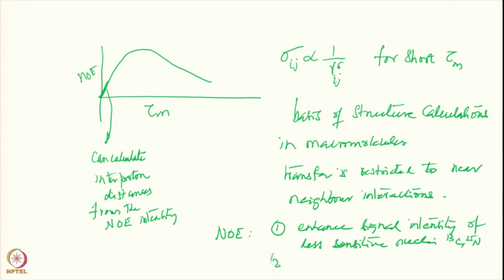And the second is to derive structural parameters of macromolecules. So, these are two important applications of NOE.